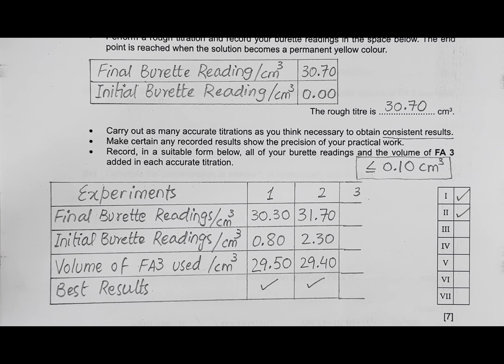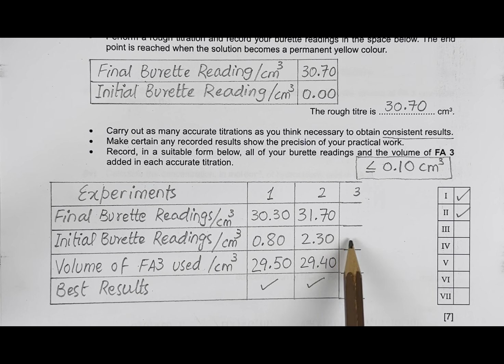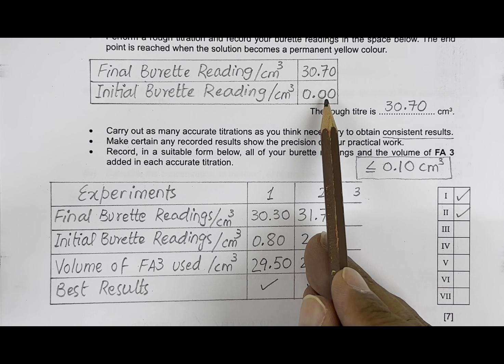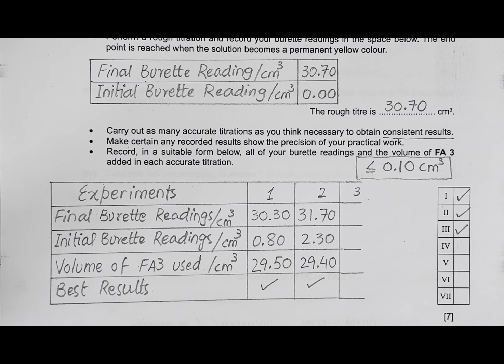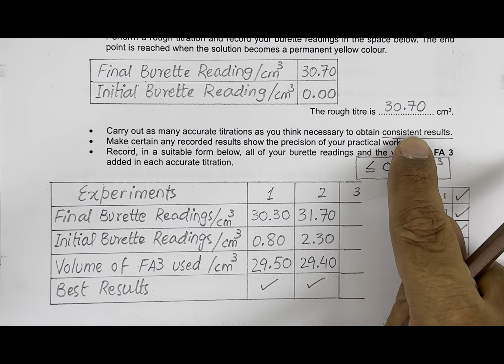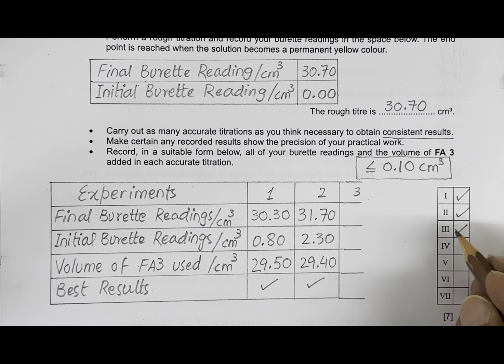The third mark is for the readings of burette recorded up to 2 decimal places. So here are all values recorded up to 2 decimal places. Even if it is 0, I have written 0.00 because it's necessary. So the third mark is for 2 decimal places burette readings. The fourth mark is for consistency in your work. So I have got 2 consistent results, therefore this mark is also awarded.